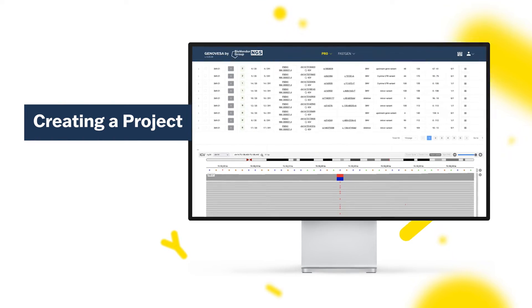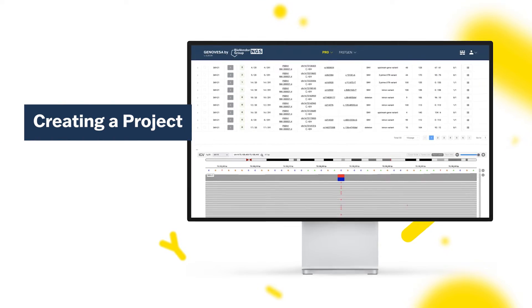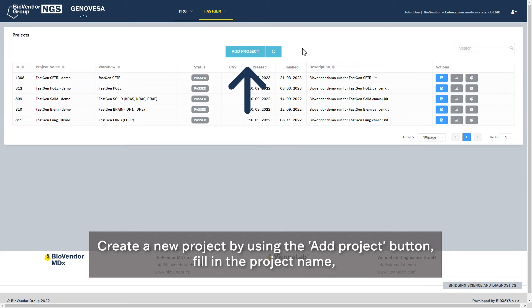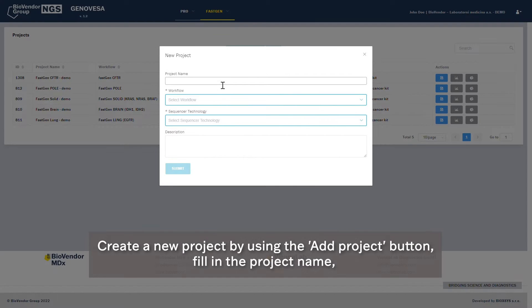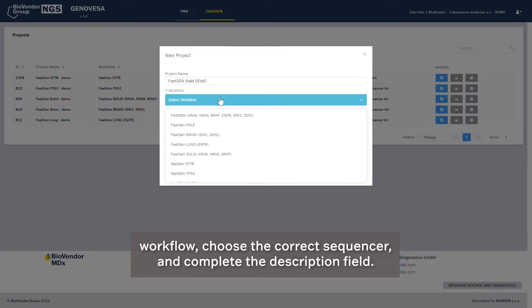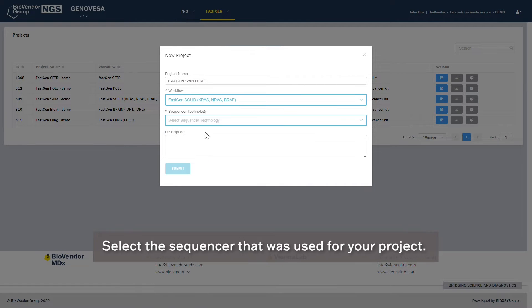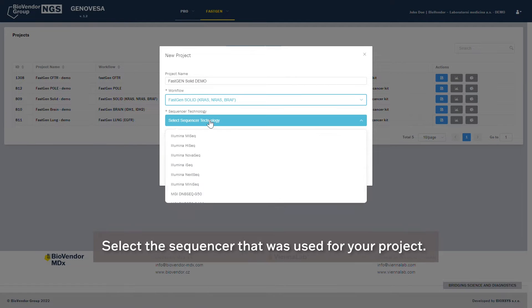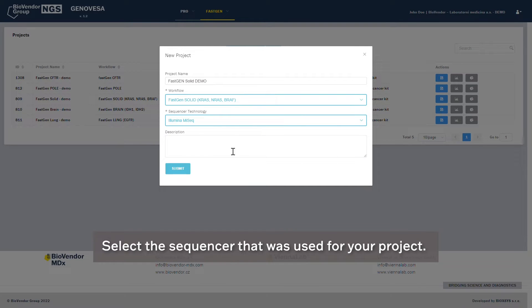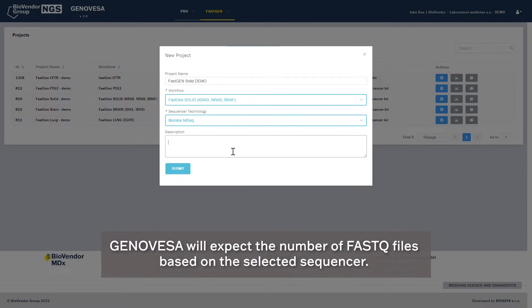Creating a project. Create a new project by using the Add Project button, fill in the project name, workflow, choose the correct sequencer, and complete the description field. Select the sequencer that was used for your project. Genovesa will expect the number of FastQ files based on the selected sequencer.